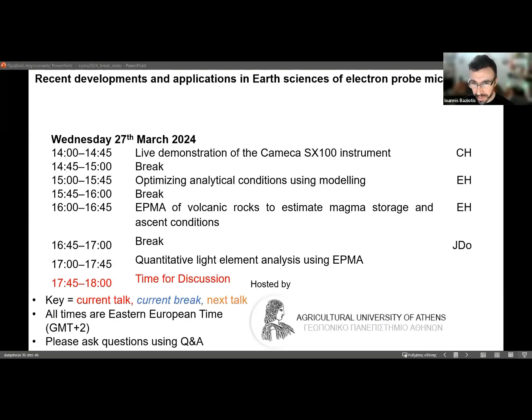I would also, while you are searching your files, like to include Sergey in this discussion, because we are a workshop, we need to learn from this. The question is, can you follow a similar process by applying this routine using JEOL or Cameca software? The answer is no, and it's because the acquisition process has to be different.